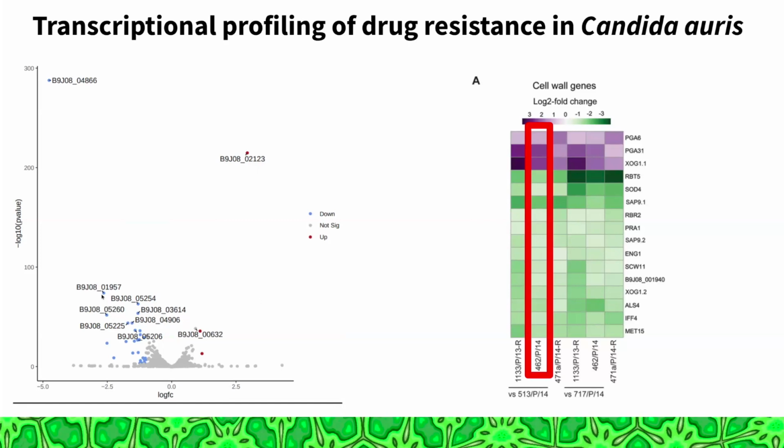One of the challenges in these analyses, of course, is the gene name mapping. And again, this is one of the areas where we would need community help for identifying gene name mappings. But you can do this. You can take a data set of any size, and you can do, for example, transcriptomic analysis, as I'm showing here. So that's one example that I wanted to show.